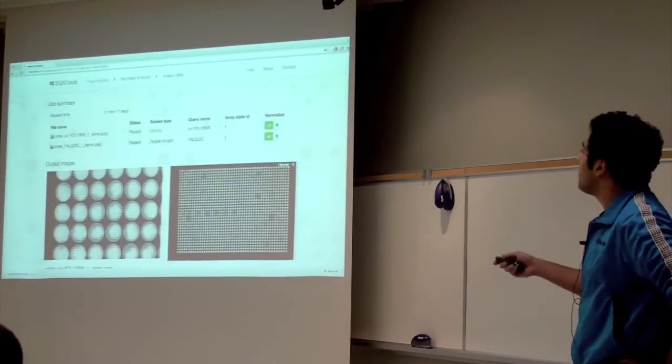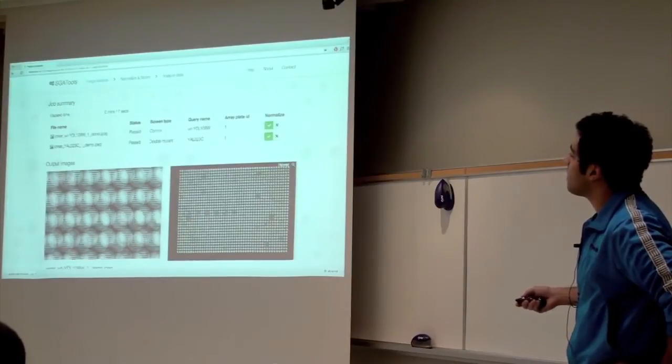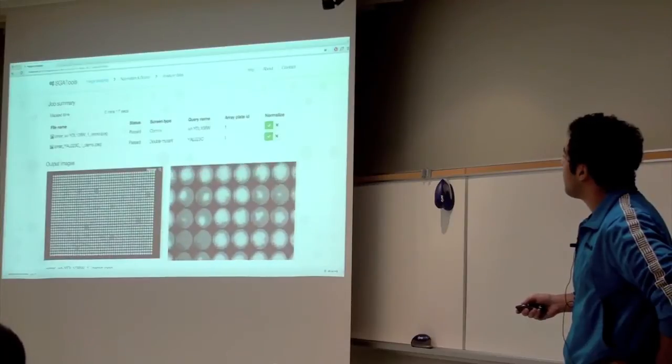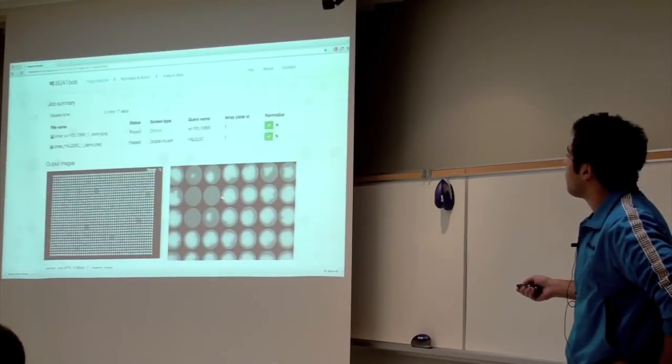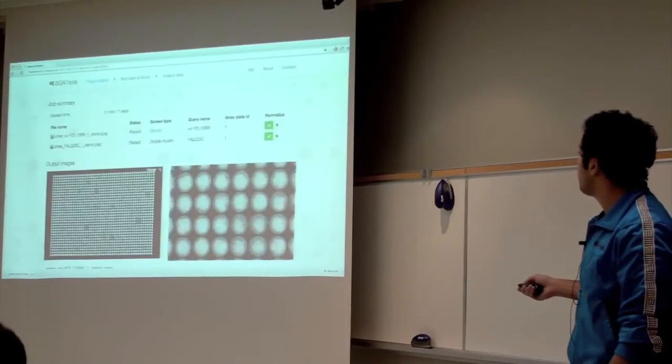You can also inspect the gridding that was done on your plate, so where the circles were placed around in case some sort of error happened or something. So you can kind of zoom into that and take a look. So what the image analysis software does is it quantifies the colony size by looking at the pixel intensities of your colonies.